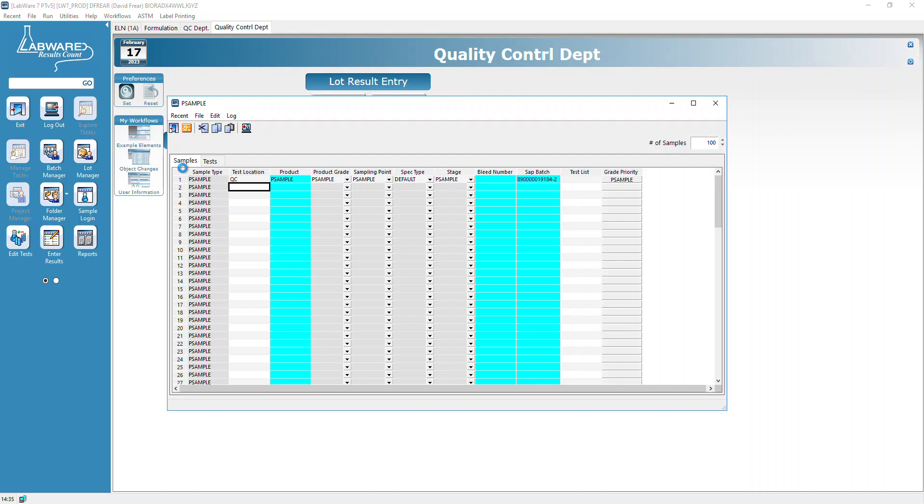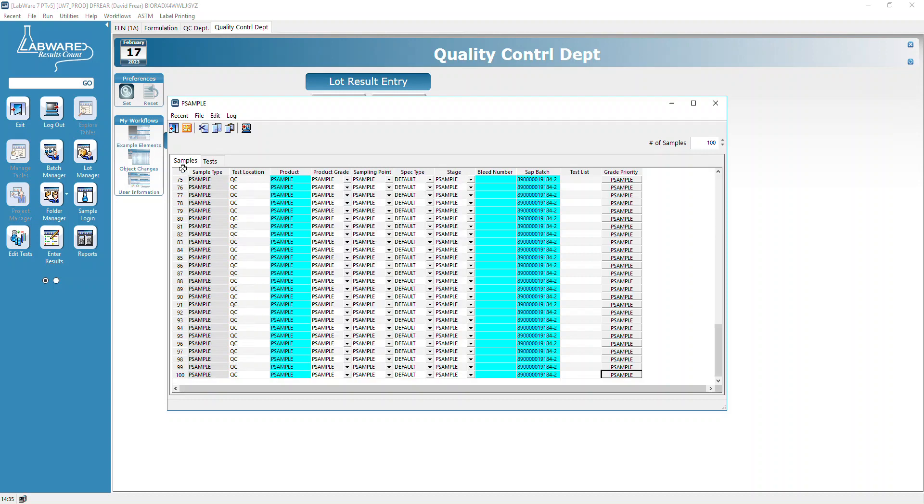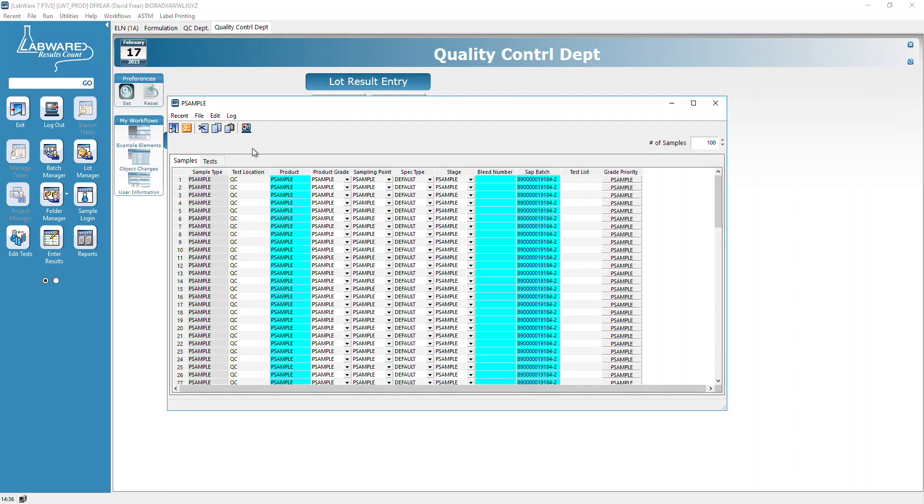We're going to propagate down. This may take a few seconds, but not as long as if we were to copy and paste. There we go - you can see we're down to number hundred and it all propagated. Beautiful.